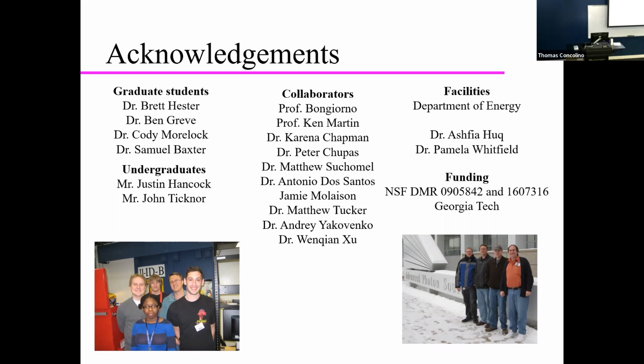And in that case, we built custom sample environment. We bought commercial grade 5 titanium tubing. We built heaters. We built a pump. We put internal collimation into the pressure vessel. We spent a lot of time and money building custom environment. So it depends.